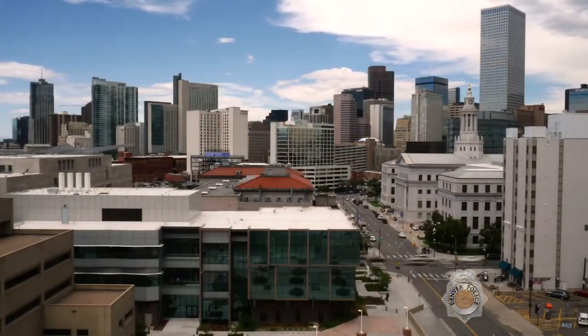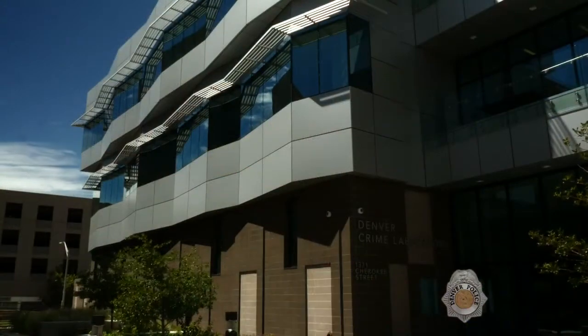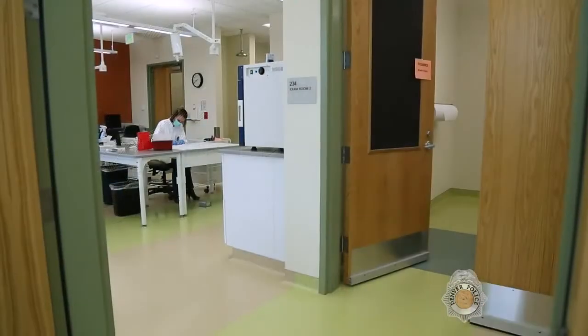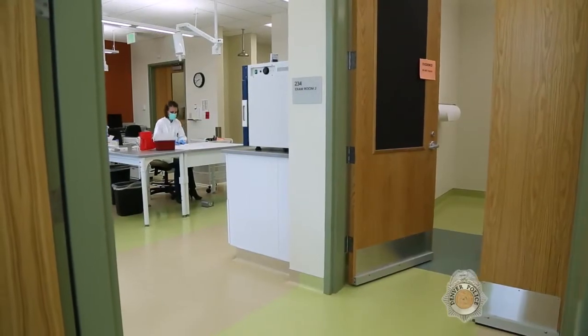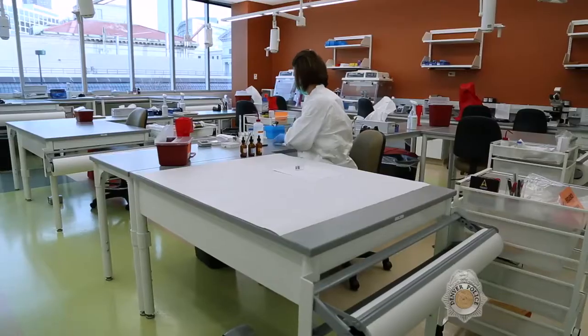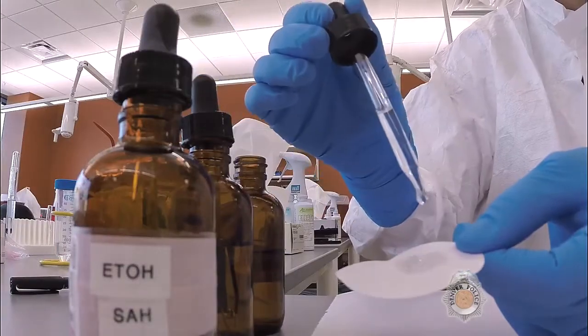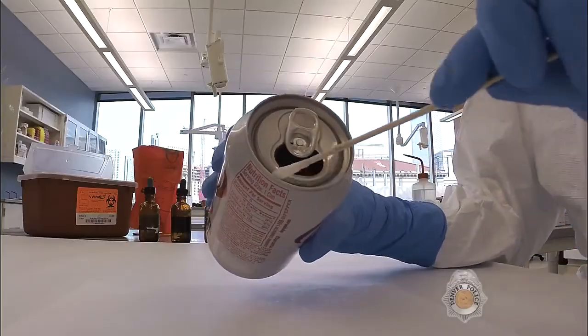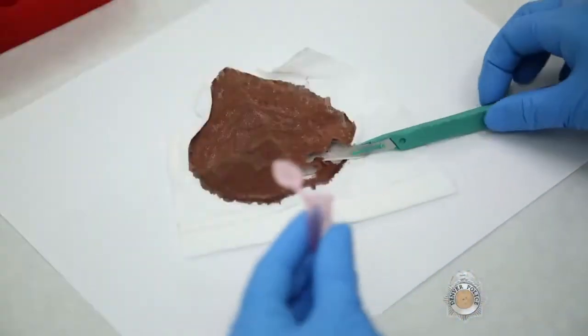The Forensic Biology and DNA Unit occupies the entire second floor of the Denver Police Crime Laboratory. The Forensic Biology Unit examines evidence recovered from crime scenes for potential biological matter. They identify biological fluids, then take swabs or cuttings from the evidence and process them for analysis.